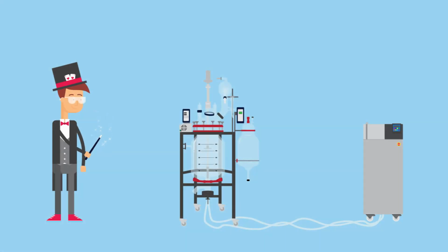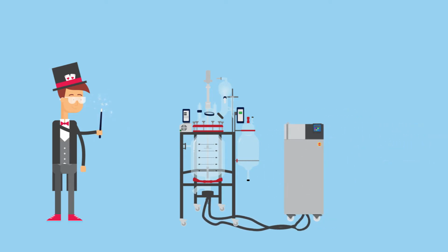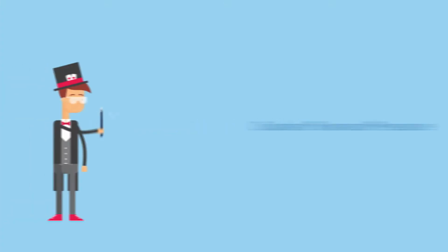excessive cycling. When selecting a circulating chiller, it is important to know the desired temperature of the coolant as it enters the inlet of your equipment, as well as the heat load that needs to be removed. Consider that some heat may be gained as the coolant travels from the chiller to the instrument. Insulated lines and positioning the chiller as close to your instrument as is practical will reduce some of the heat transfer. It's also important to consider both flow and pressure of the coolant.